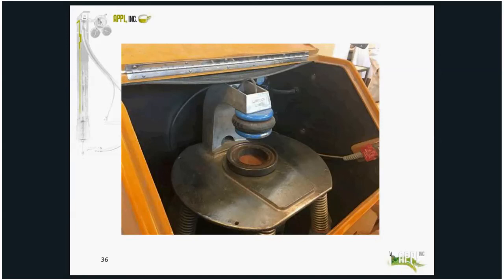This is a LabTech ESSA LM2 ring mill. It's capable of grinding to 75 microns. For samples that may contain nitrocellulose, we typically grind 5 by 60 seconds, but mostly we grind a single 60-second or a 90-second grind, depending on the compounds of interest. If the bowl gets hot during the grind, we'll wait 2 minutes before the next grind.